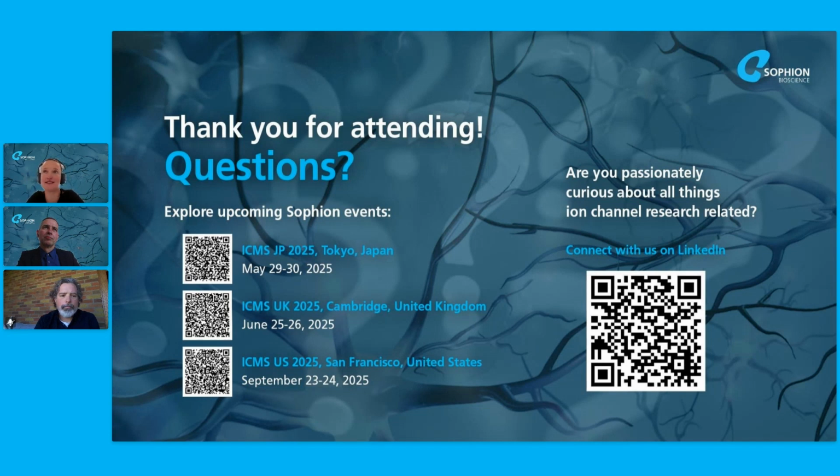Otherwise you are right. For many of these things, it's only recently that we have really started getting good enough success rates that we can actually get very useful data out of our measurements with neurons. And it's extremely relevant to see and compare how our data compare to neurons that are attached to the surface. So this is not something that we have done recently, and it would be super interesting to revisit if we get the right collaboration around that.